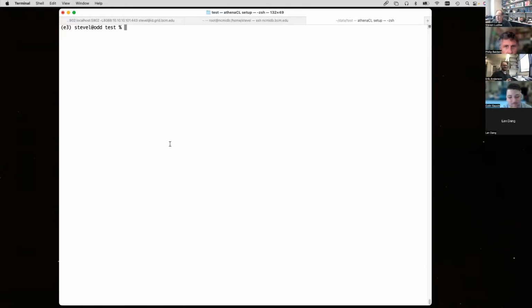So my thought was this time maybe we would talk about some of the basics, and some of the stuff we probably didn't actually talk about in the first couple of weeks either. If anyone has stuff they want to talk about, questions to ask or anything like that, we can start with that, because I don't have a real major agenda with the other sort of thing. I just thought I'd cover some general purpose image processing and format conversion and metadata and that sort of stuff a little bit.